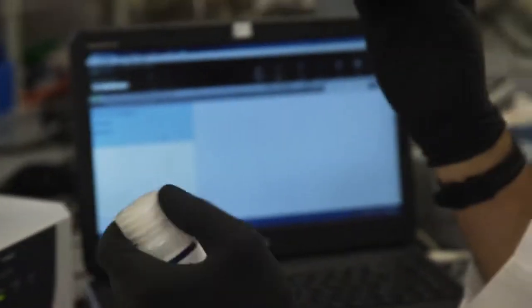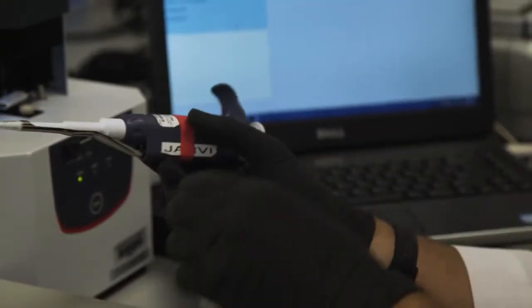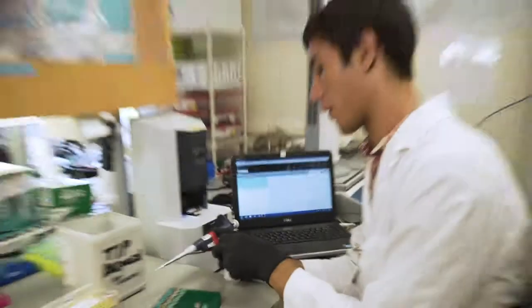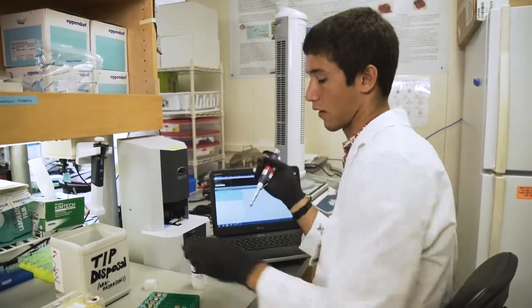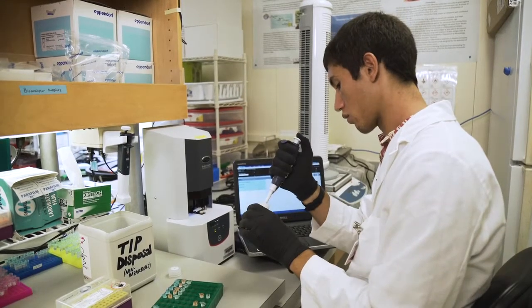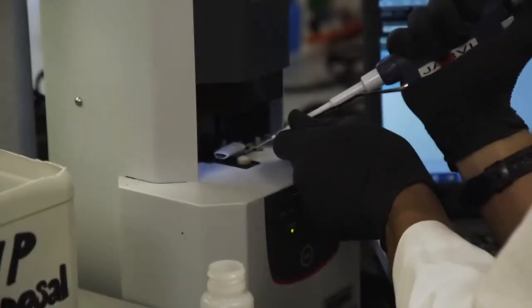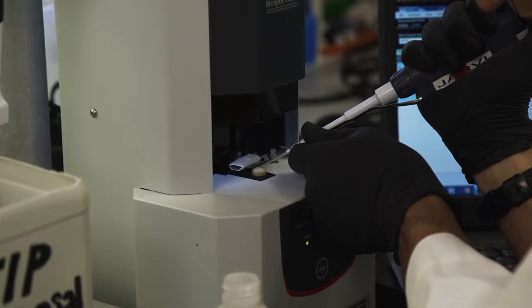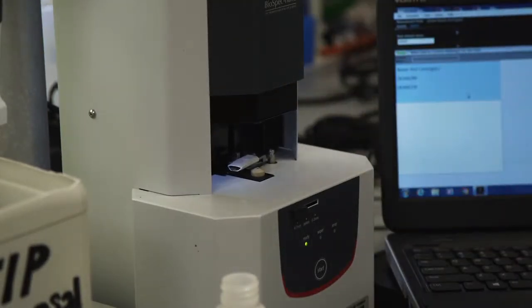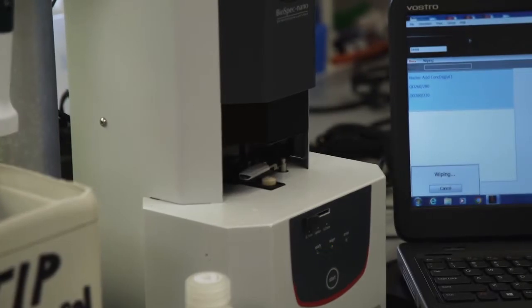The first thing to do is we have our elution buffer here from our last step. This is what the DNA is in. So what we have to do first is set what's called a blank, so the meter can adjust or ignore certain things. Since we definitely know the DNA is in the AE buffer, we will use the AE buffer as our blank. We take 3 microliters and load it onto this real tiny speck here, which can be kind of tricky. But you do it. Then you click this button up here that says blank, and you can hear it clicking softly, although I don't know if that's going to make it through the mic.